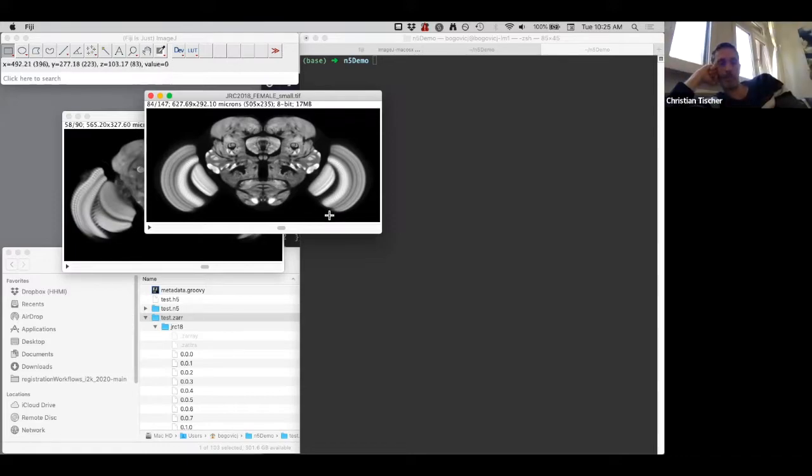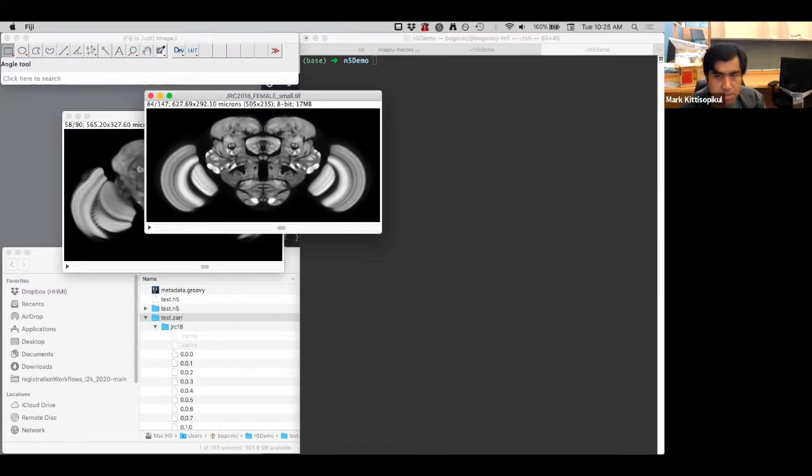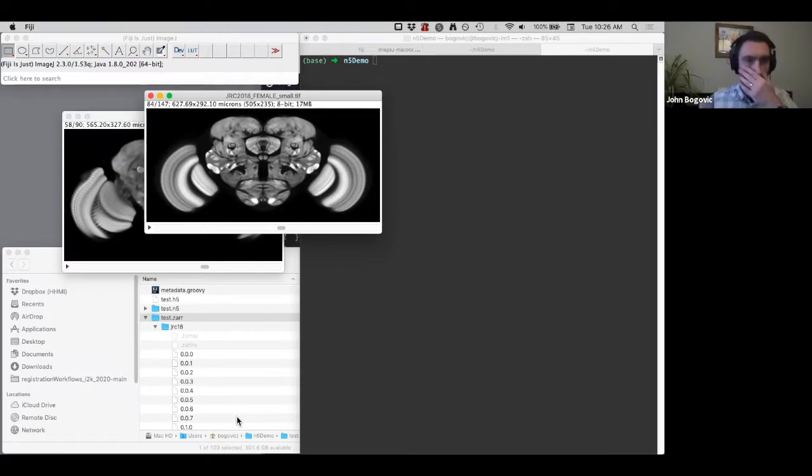Okay. John, I just noticed a question from John Milkey in that chat. He's asking about the metadata and what the best practice is for us to adopt. So I guess you showed us a little bit of the metadata, the JSON, and you showed us in the H5, and I'm assuming we would find the same thing in the Zarr. What's your current outlook in terms of reconciling all this and making everything work together?